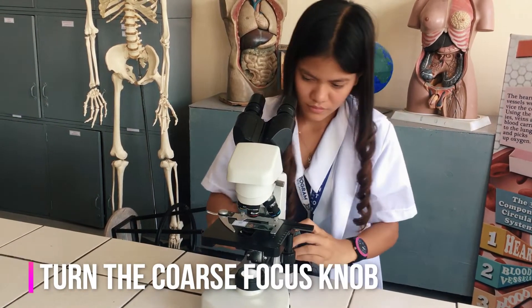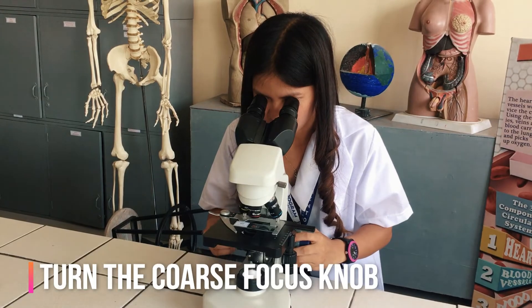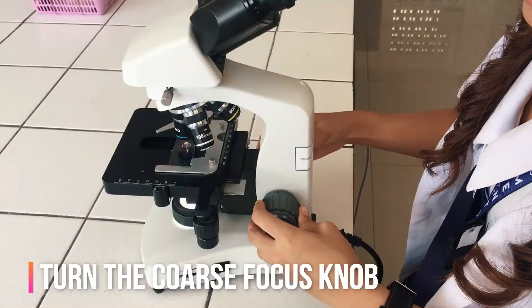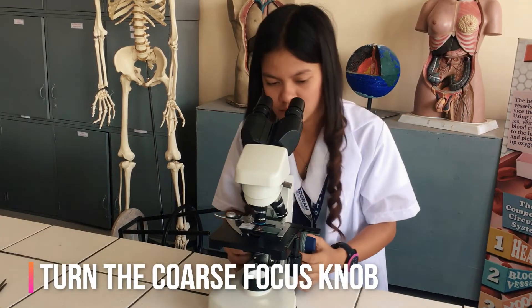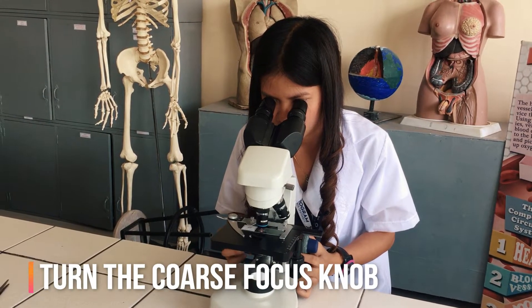Look at the objective lens and the stage from the side and turn the coarse focus knob so that the objective lens moves downward, or the stage moves upward. Move it as far as it will go without touching the slide.